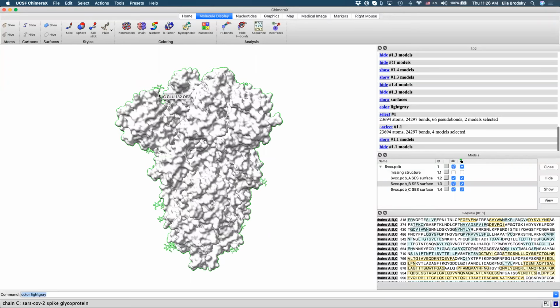All right, so I'll just continue. Now here we have the sequence of our protein, right? So the question is, how can we find specific differences that we observed in the alignment that we did? I don't see the green AAs. Okay, yeah, so this coloring, you can right click here and you'll have settings. And it actually doesn't matter. You can select these, and this is going to show you different structural components of this, but don't worry about it right now. We're not going to use that right now.